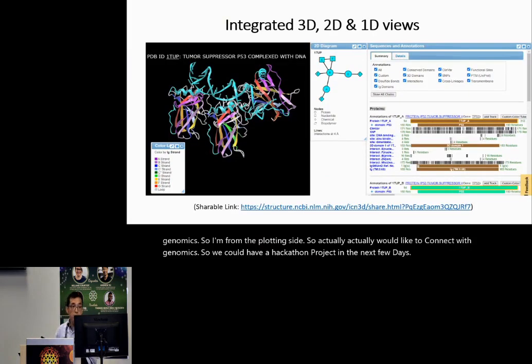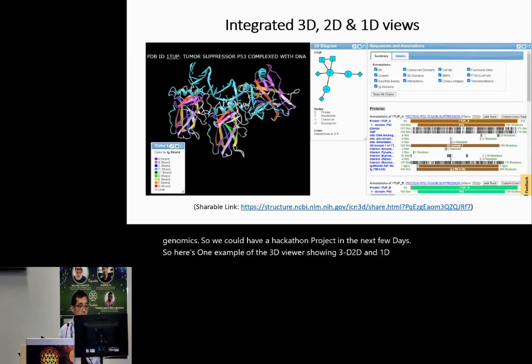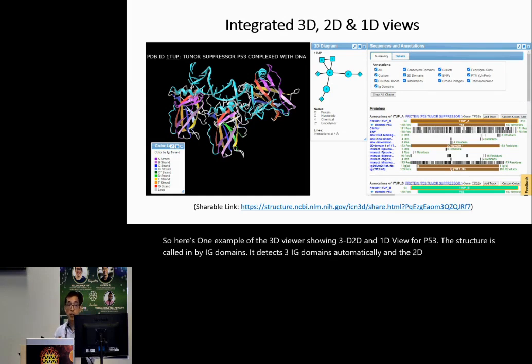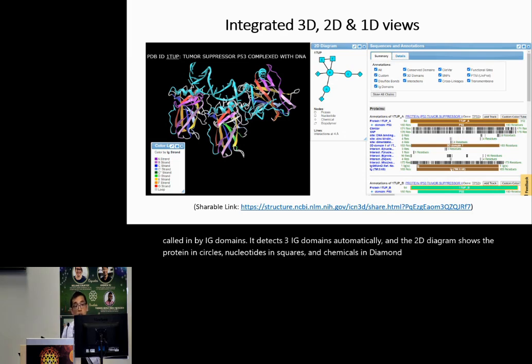Here's one example of the 3D viewer showing 3D, 2D, and 1D view for P53. The structure is colored by IG domains — it detects three IG domains automatically. The 2D diagram shows proteins in circles, nucleotides in squares, and chemicals in diamonds. The right side shows the sequence and annotations.